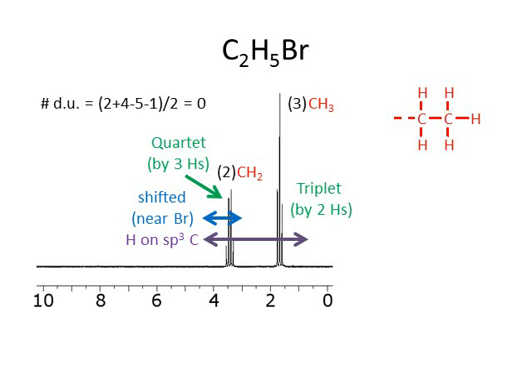A CH2CH3. But that's not all my pieces, because if I look at my formula, I've got C2H5Br, and I've only accounted for 2 carbons and 5 hydrogens, which means I also need a bromine. But now this is really easy, because if I put these together, I get bromoethane. We should always go back and check ourselves. I have no degrees of unsaturation. Both of my sets of hydrogens are on sp3 hybridized carbons. One of those is closer to the bromine.